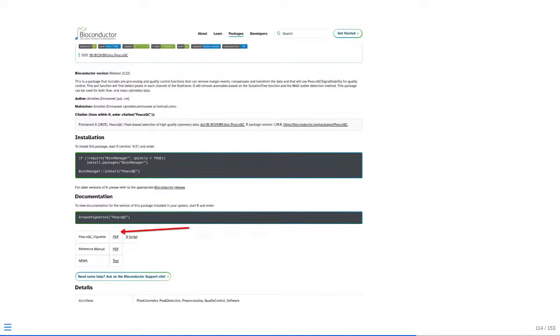And then Bioconductor is kind of halfway between what we see for the CRAN repositories, all text-based, and a pkgdown style website. Bioconductor does a really good job at documentation, especially with their vignettes. If you find a package that's present on Bioconductor, when you navigate to the web page and scroll down, it'll generally be either a PDF or an HTML format of the vignette. Just click on that, and it's similar to what you would see in a pkgdown style website's article view.